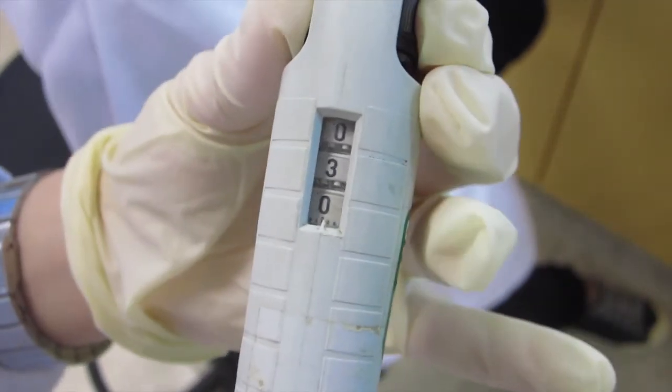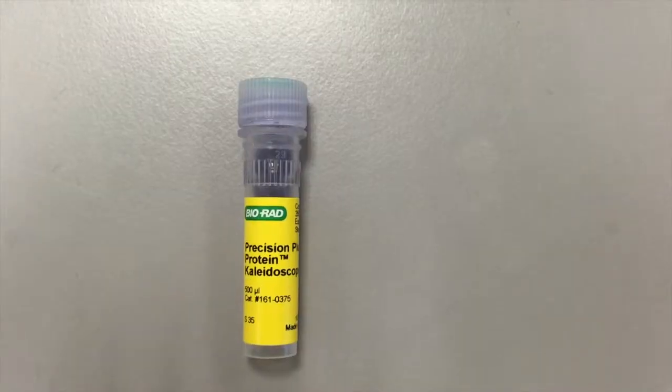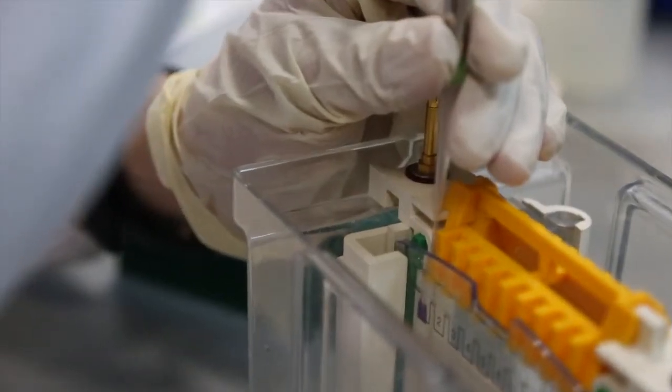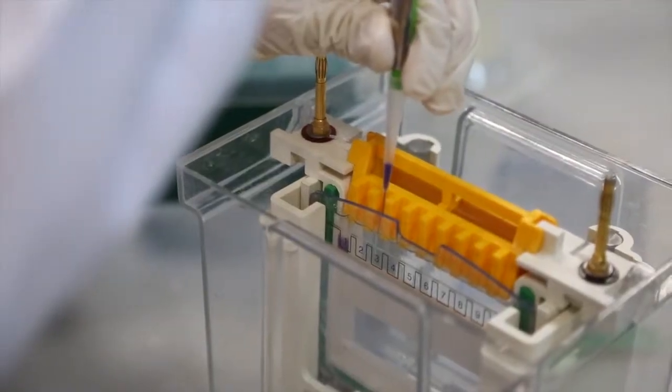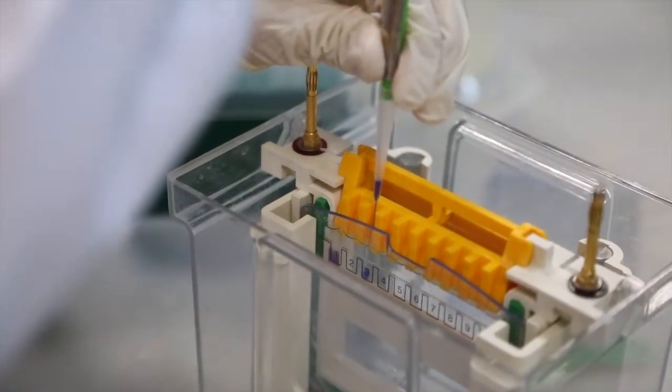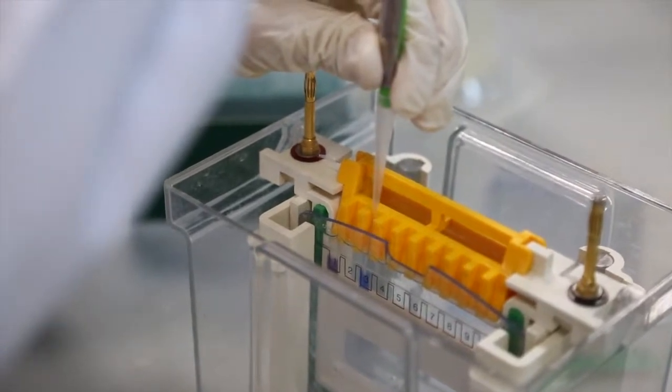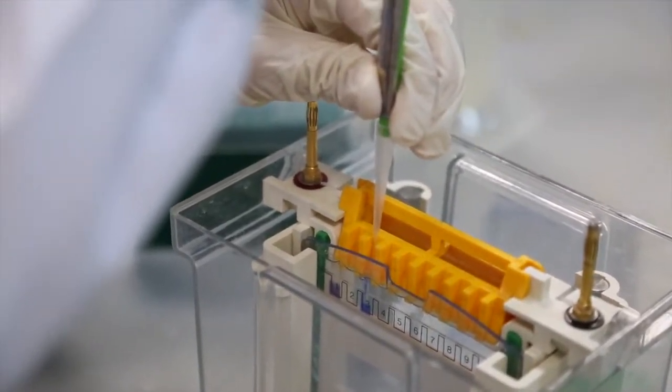To prepare for the electrophoresis analysis of the protein sample, first adjust the micropipette to 30 microliters and load the same volume of kaleidoscope protein standards into the first well. Then load the sample solution prepared earlier into the remaining 8 wells with a space between the first and the third.